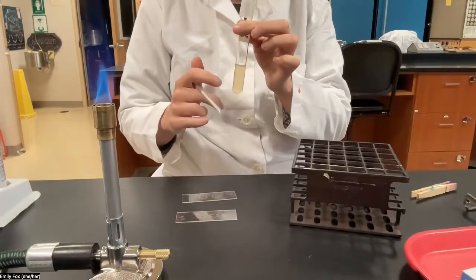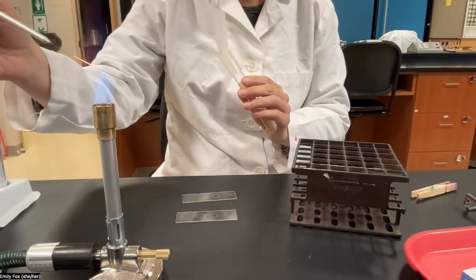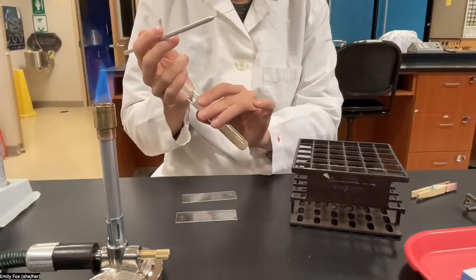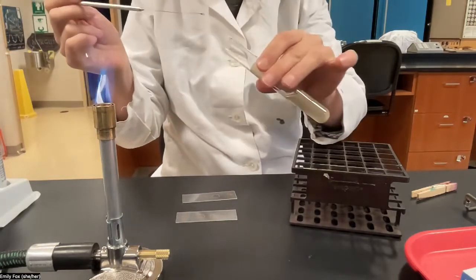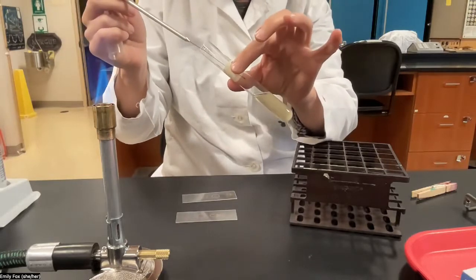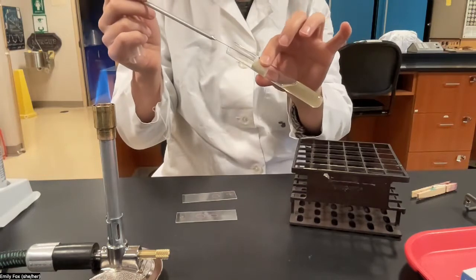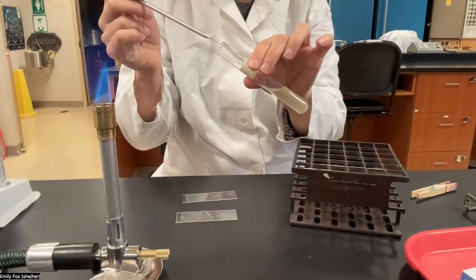Click the tube to resuspend the cells. And then we'll flame the inoculation loop. Pull the lid off. Remember to hold your tube at an angle to prevent spores from falling in it. And then we're going to wait 30 seconds with the loop inside the tube to let it cool down before we retrieve any culture.